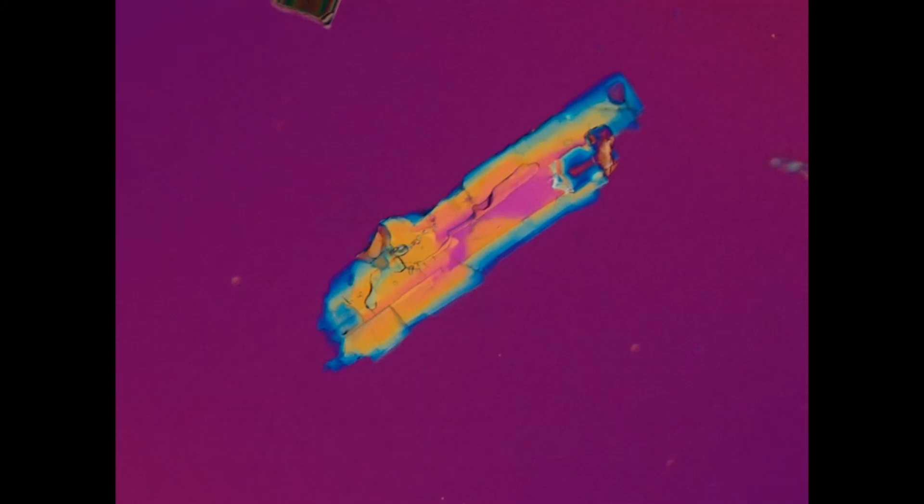The habit, the positive elongation, and those step-like features point to this grain being a kyanite.